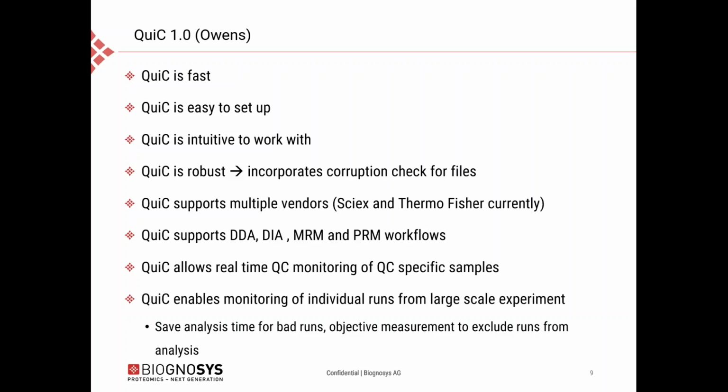It supports, as I said, multiple vendors. At the moment we have full support for Sciex and Thermo Fisher, and are of course in the process of adding more and more vendors over time. It supports all major workflows such as DDA or shotgun proteomics, then data independent acquisition, MRM and PRM.